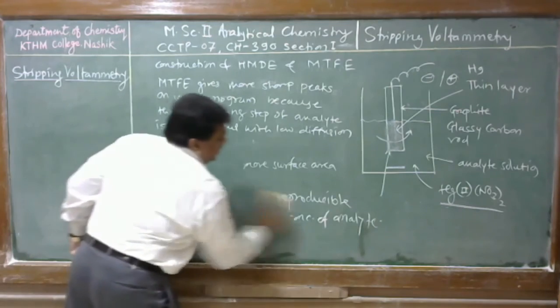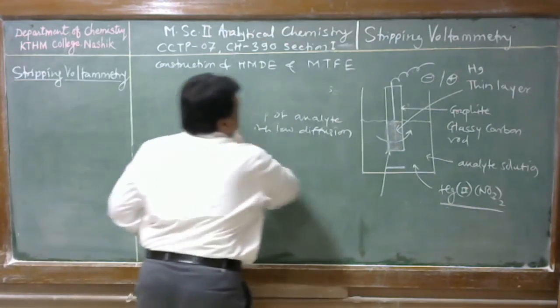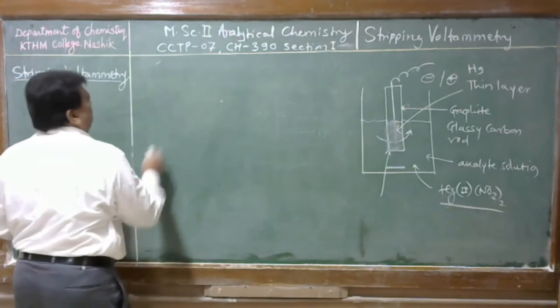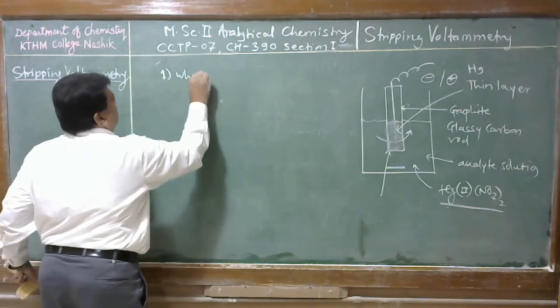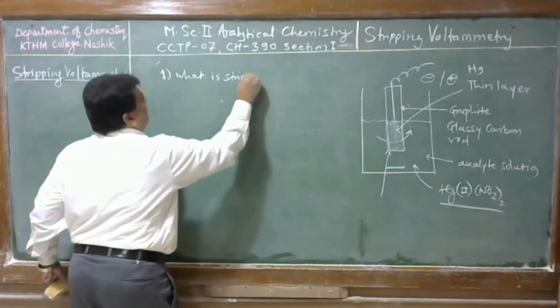Student, with this discussion, you can find out the answers to the following questions. Question number 1: What is stripping voltammetry?